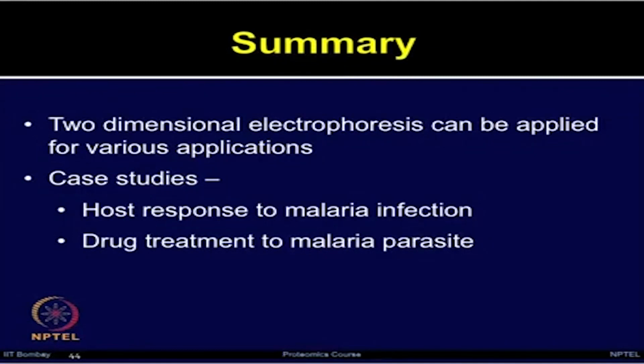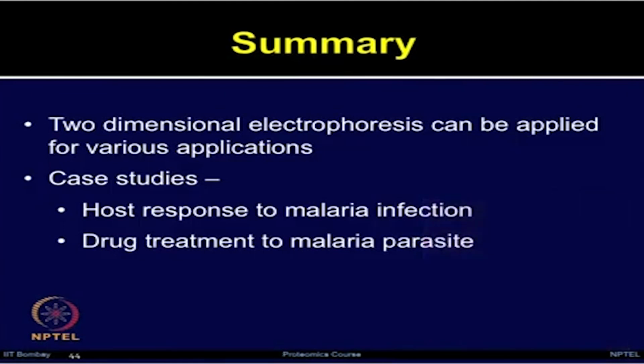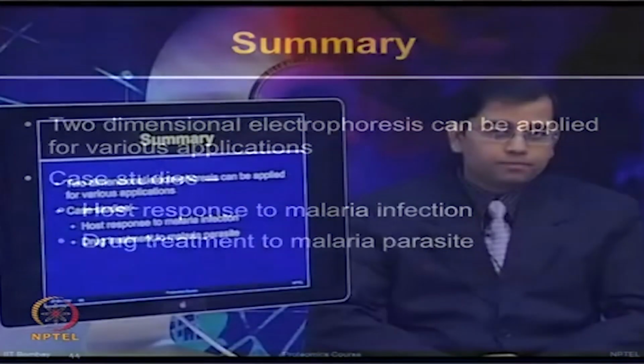Today we talked about how two-dimensional electrophoresis technique can be applied for various biological applications. Although I thought I will be able to cover two case studies on malaria, one on the host side, like how host response can be monitored due to the infection of Plasmodium vivax, and then second study which I was going to take was based on the effect of a drug on another Plasmodium species, Plasmodium falciparum.